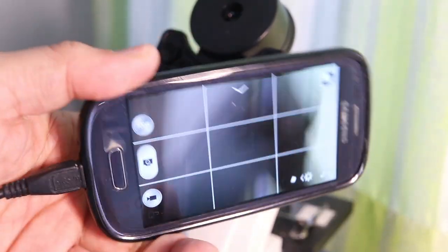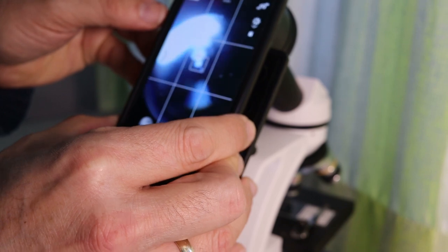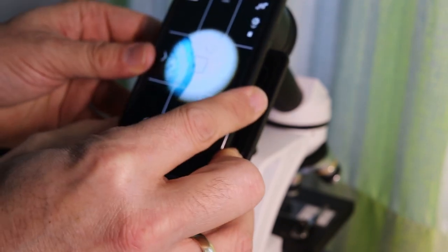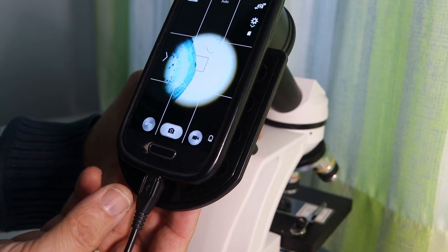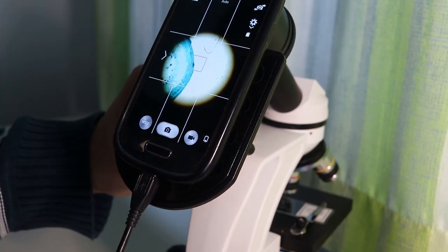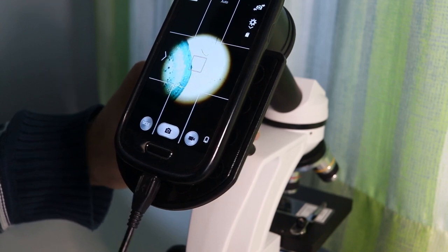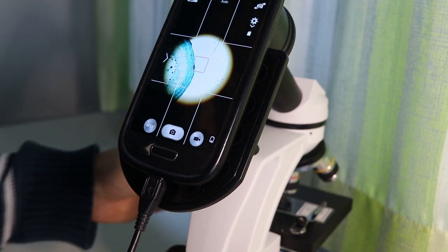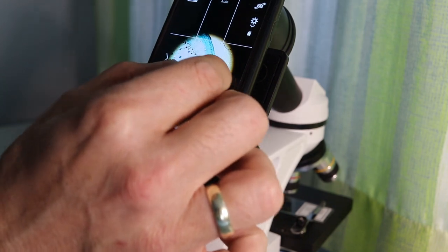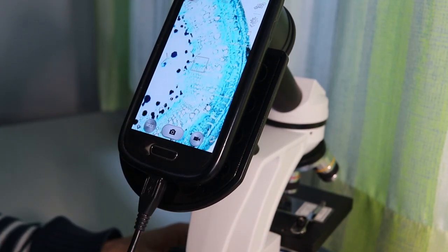So I'm using now my second mobile phone. This one does have a smooth cover, and this one did stay quite well. But again, here we have the problem that there is only a relatively small area that you can actually see, because it's not possible to move the mobile phone closer to the eyepiece. So that is actually the largest field of view that you can get. Even when I removed the plastic cover of the mobile phone, I did not get this full view, so I had to zoom in again.